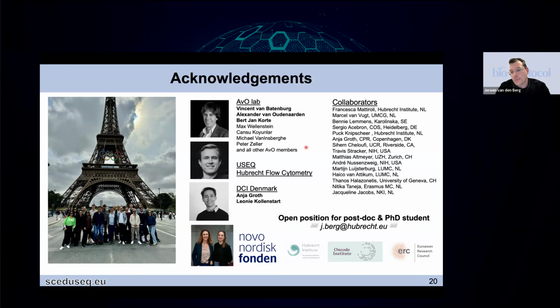Yeah. Okay. There's another question by Salah who asks, how does EdU incorporation affect the fidelity of DNA replication? And how do you control for any potential artifacts introduced by EdU during the sequencing process?